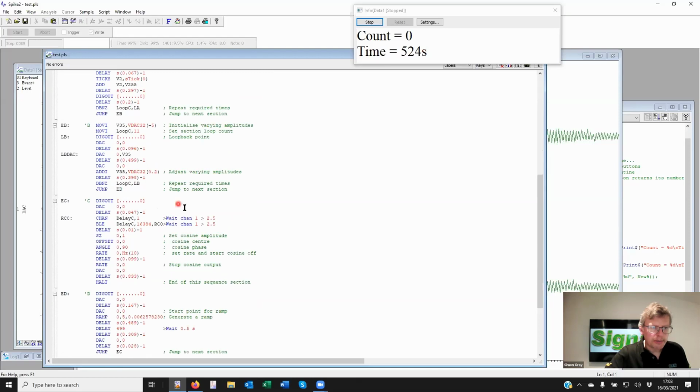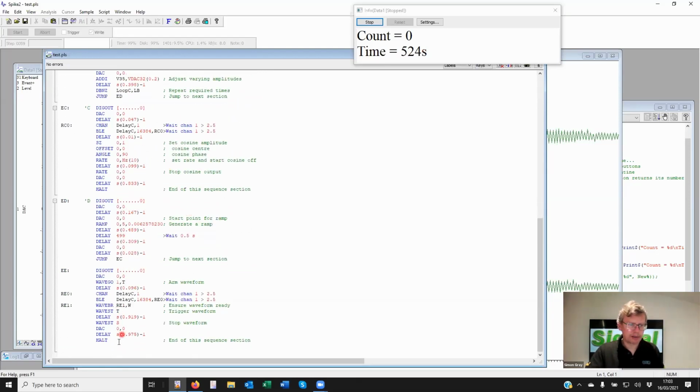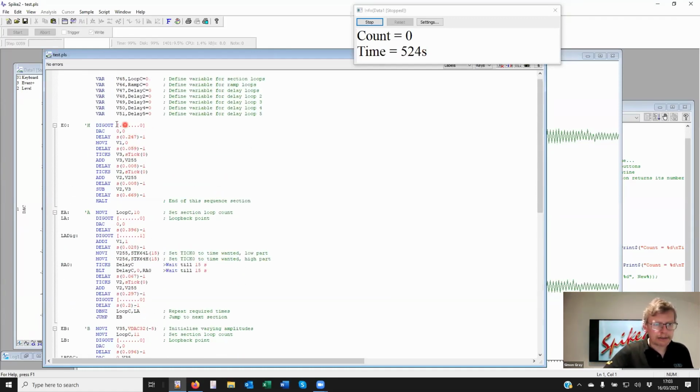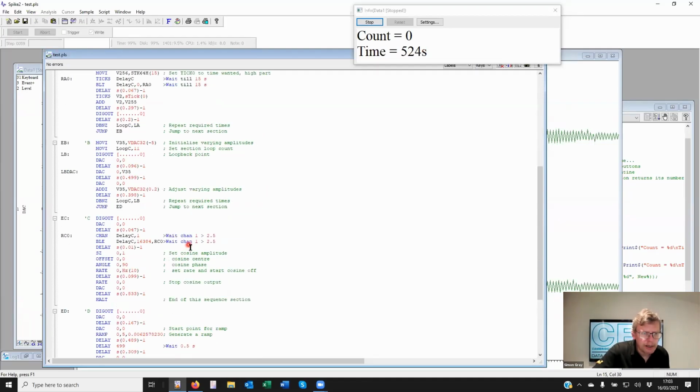All right. So we could take sections of this output and make our own sequence, or we could modify what's here, renaming things like the variable one, etc., with a real name, an understandable name for us. What else have we got? A good thing to talk about.